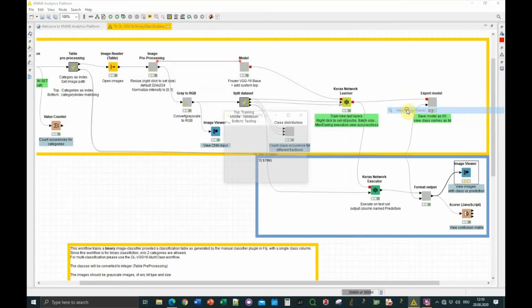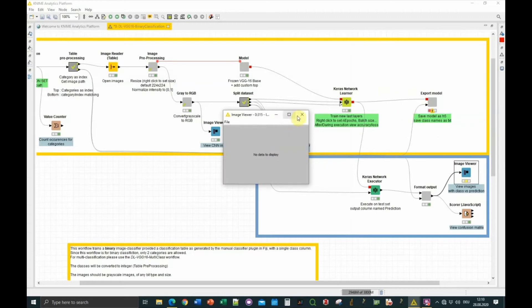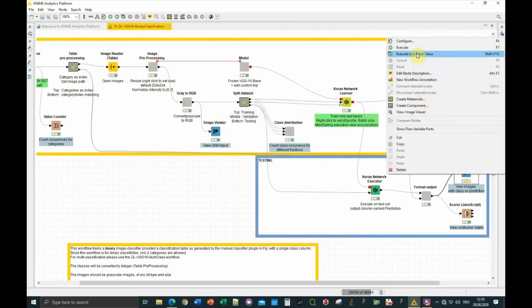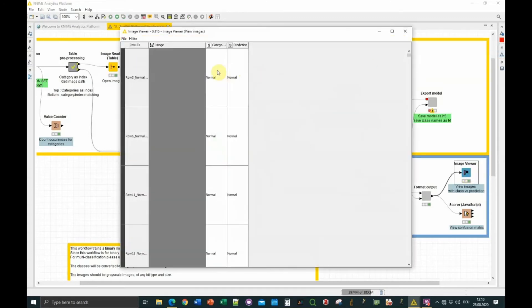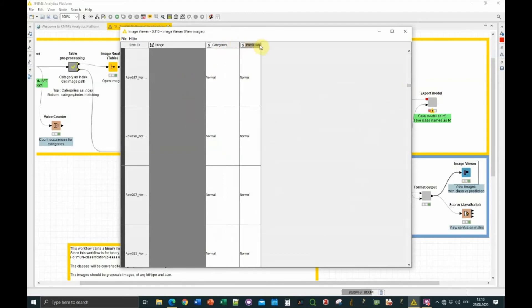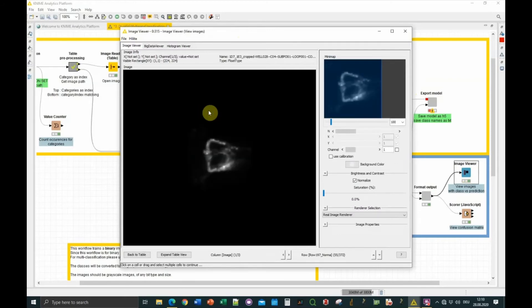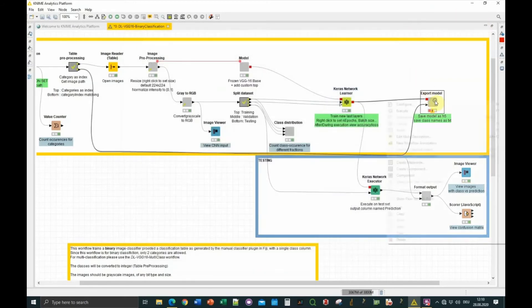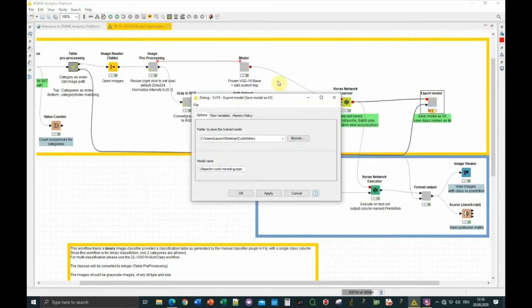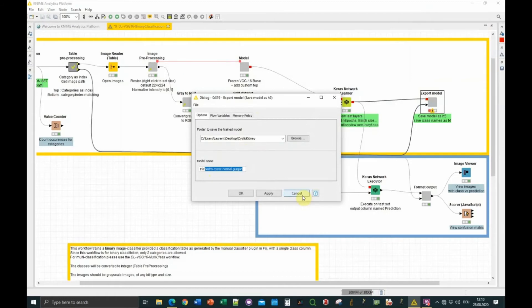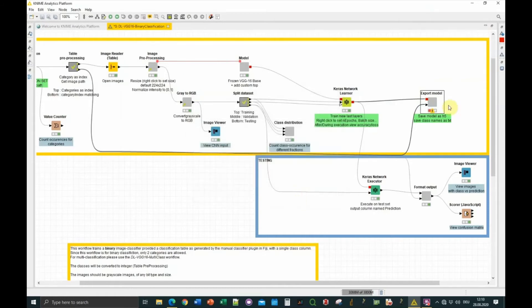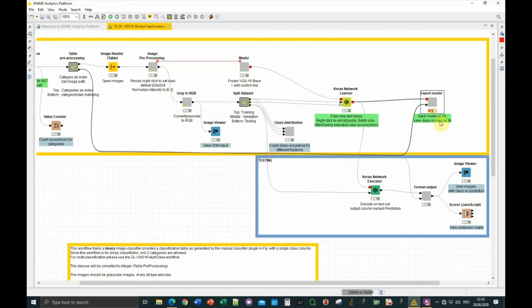On this side you can see the category and the prediction, and if you click on the image you have a preview. Finally, the model can be exported to the directory of your choice. You can use any name, and this saves two files: one H5 file which contains the trained model, and a text file which contains the class names, which is important for prediction because the prediction by the model is just an integer initially.